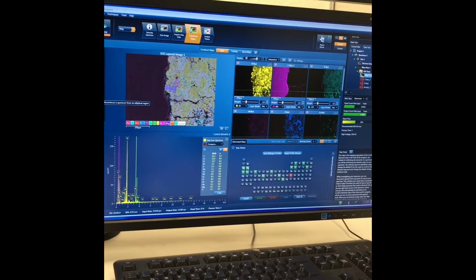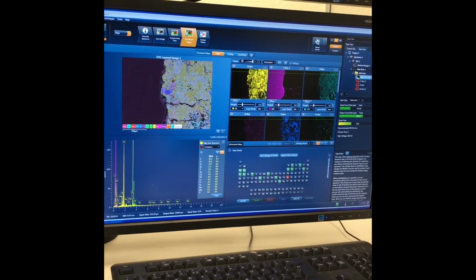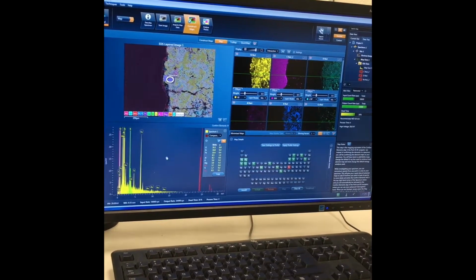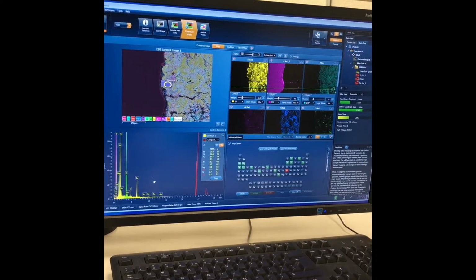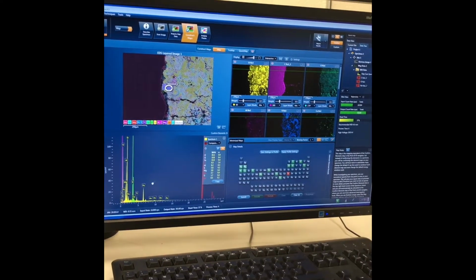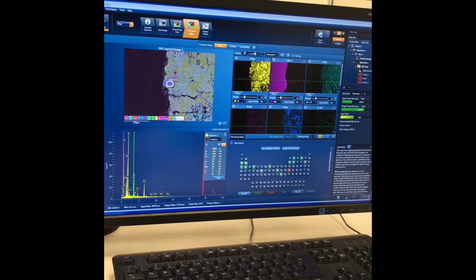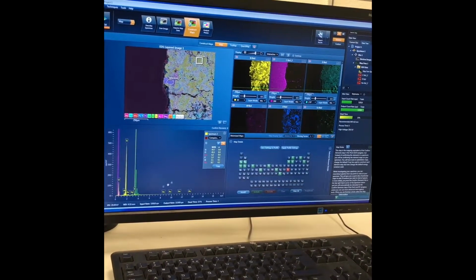So I'm going to take the elliptical region, and then I will go over this area, which should be iron rich. And then you can see that I've gotten a spectrum from it. That's pretty high quality. That's simply been made by reconstituting that data directly from the map data. The other thing we can do, obviously, is make a rectangle one. I'll do that over here in the silicon rich region. And see, still very high quality.